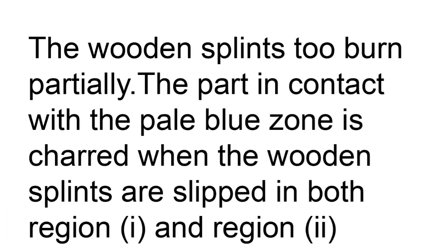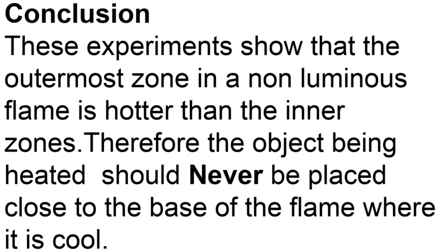So, we conclude that this experiment shows that the outermost zone in a non-luminous flame is hotter than the inner zones. Therefore, whenever an object is being heated, it should never be placed close to the base of the flame where it is cool. Instead, place it in contact with the pale blue outer zone, which is the hottest zone in the non-luminous flame.